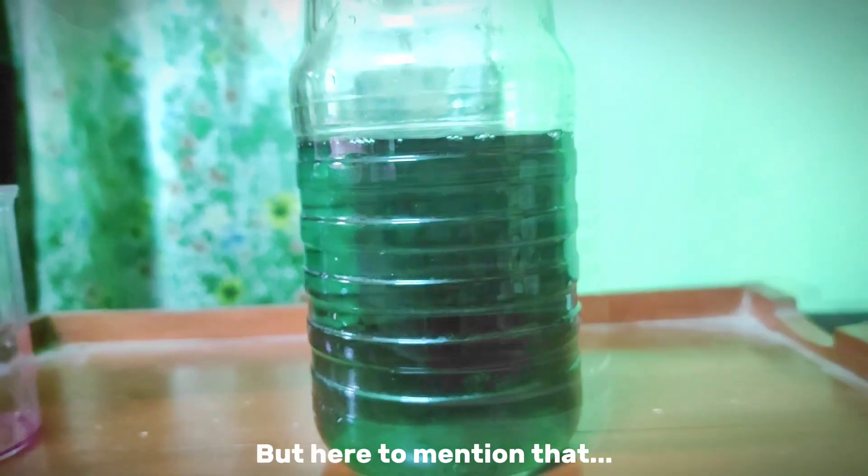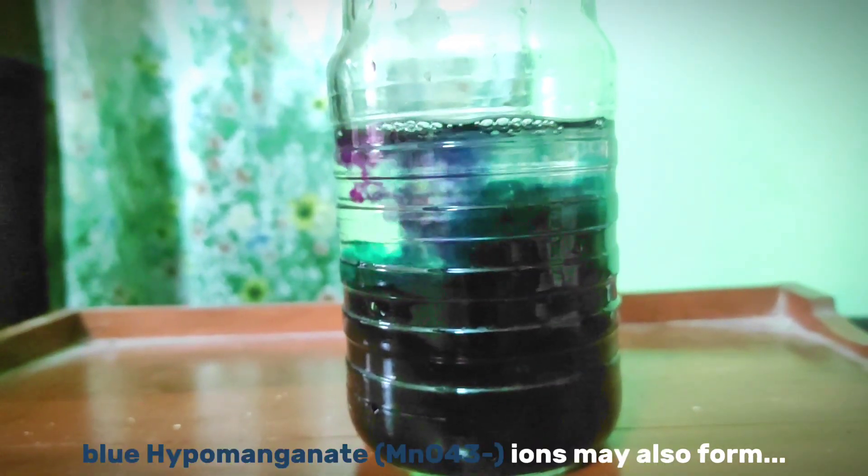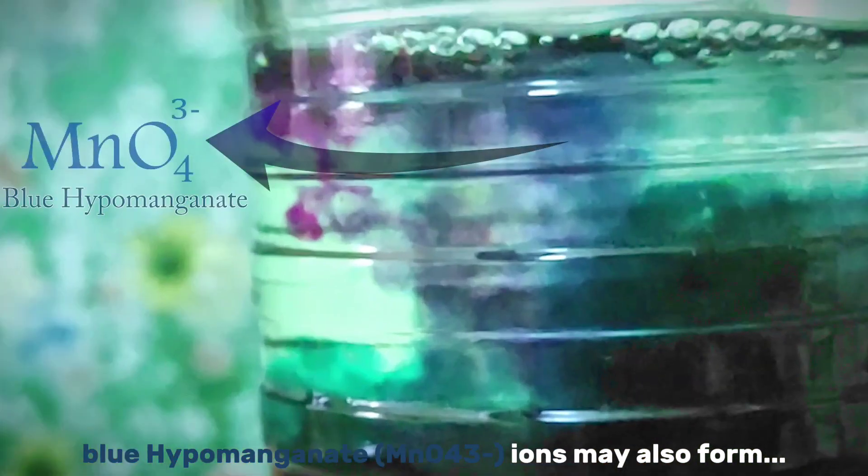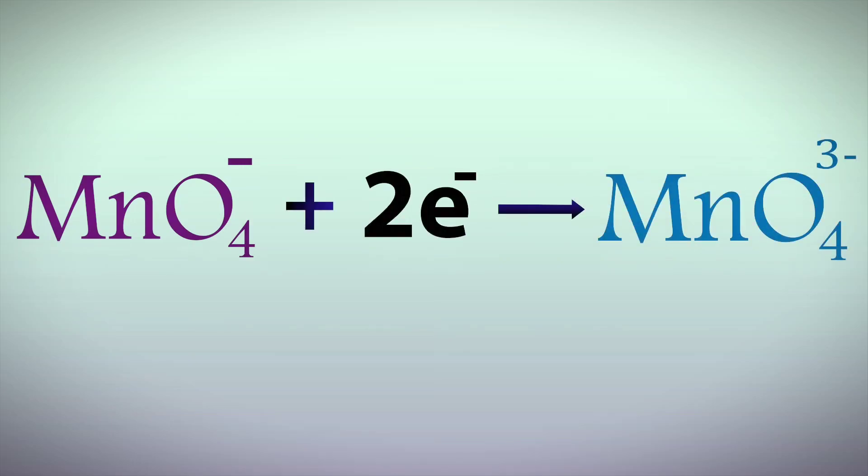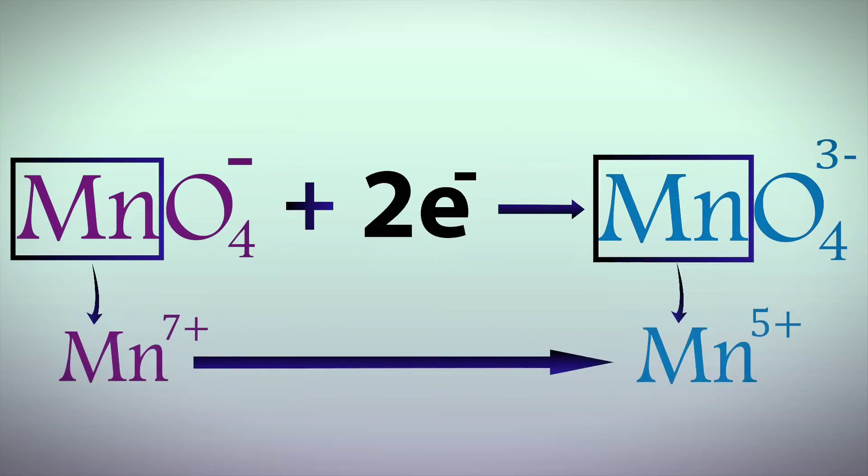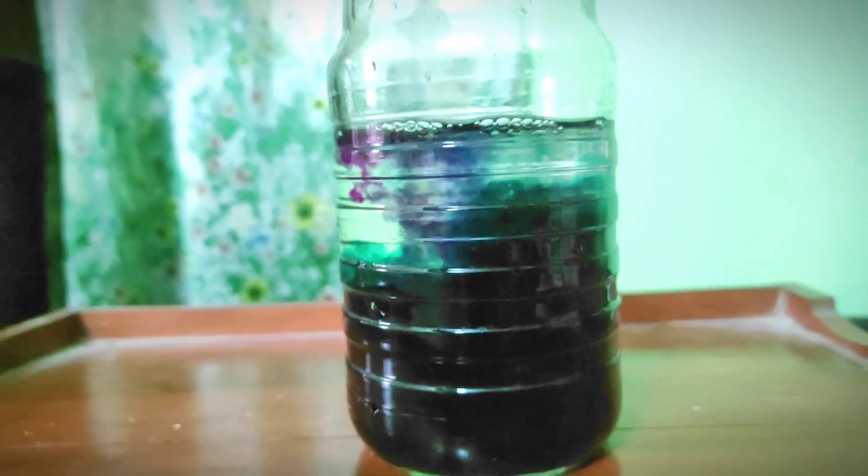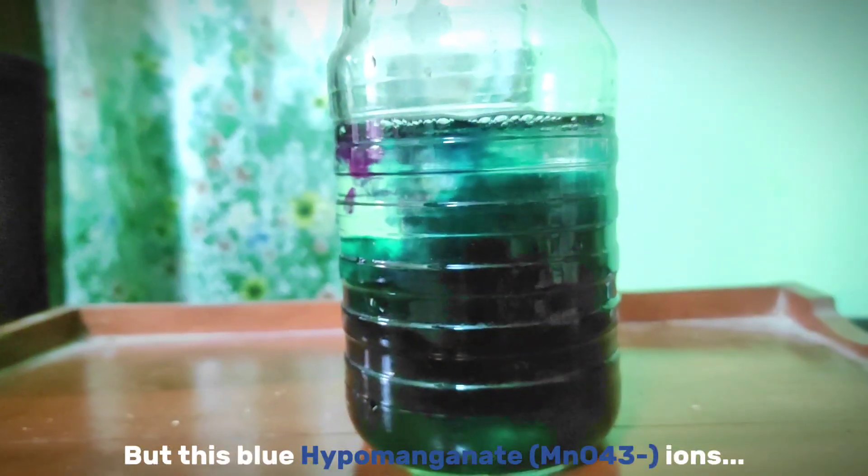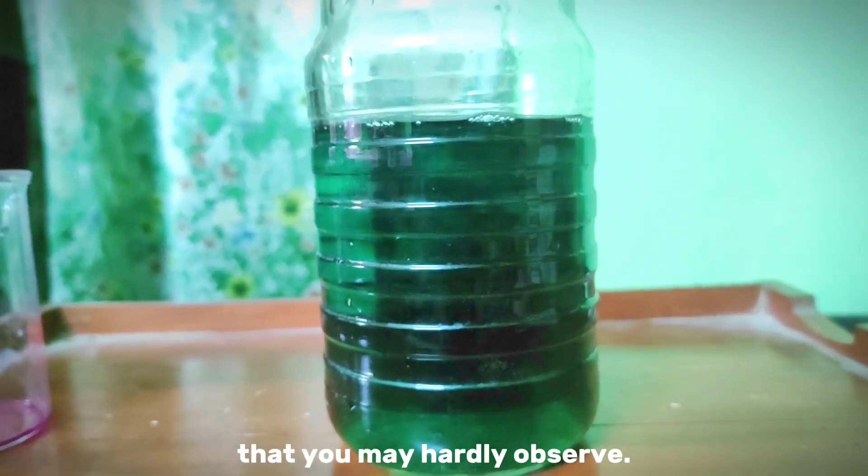But here to mention that before forming the green manganate ions, blue hypermanganate ions may also form as an intermediate. Part of permanganate is reduced to hypermanganate. The oxidation state of manganese changes from plus 7 to plus 5, and that gives the solution slightly a blue color. But these blue hypermanganate ions change to green manganate ions very quickly that you may hardly observe.